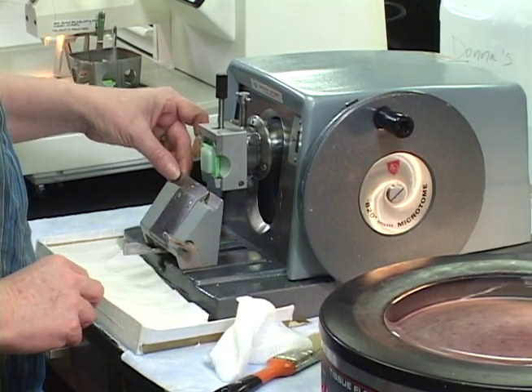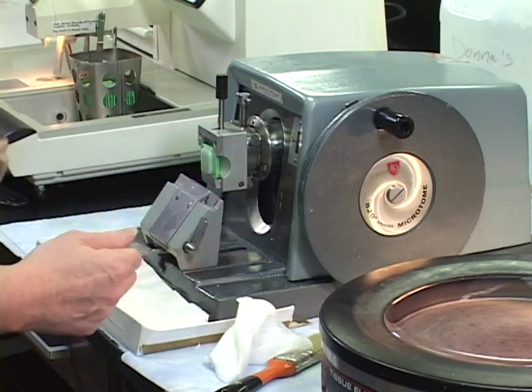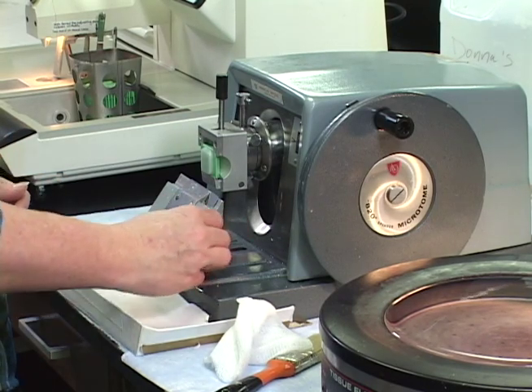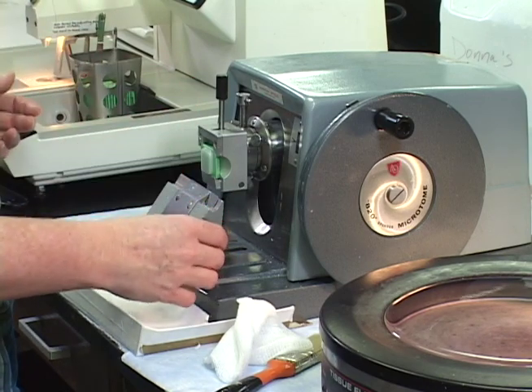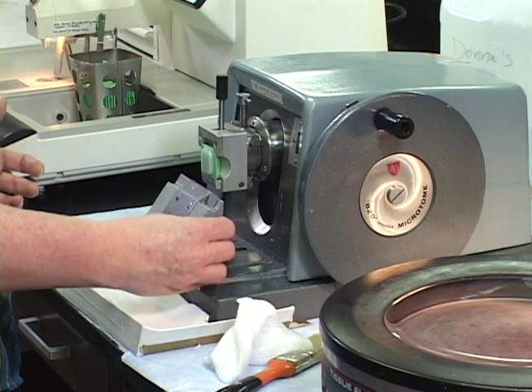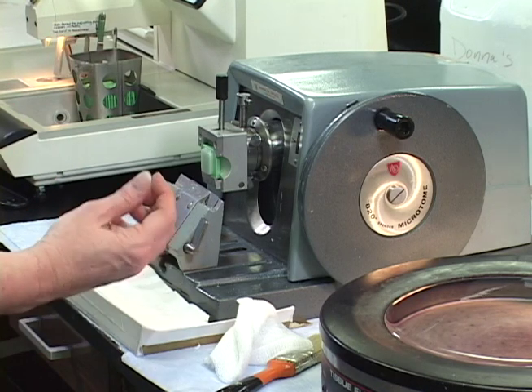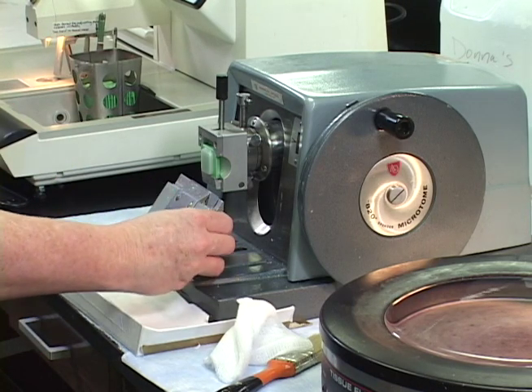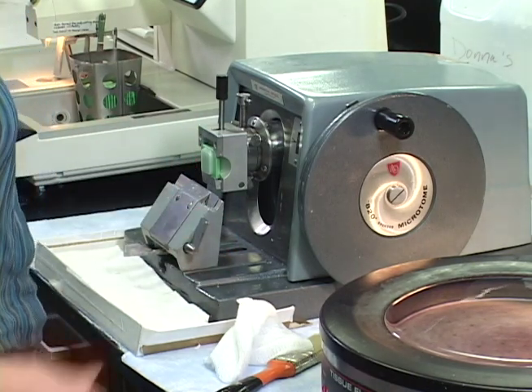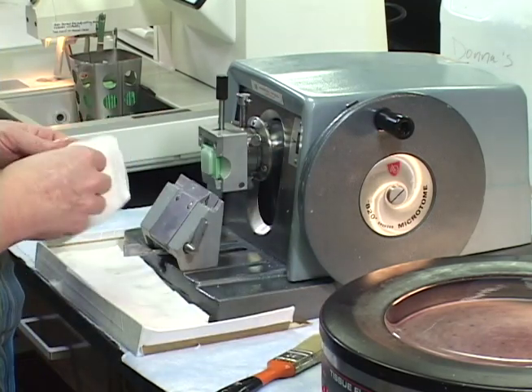Here's our knife clamp release. I put the knife blade in, and then I clamp it. Again, you don't need to crank it way over like this. And there are points in here where this is a good, nice clamp, and that's enough. It's got a little leeway for back and forth, but if you do it so tight, it actually torques the blade, and you're not going to get a good section. You get a feel for that. You can move it back a little, move it forth just a little bit, and again, it's got some clearance because it's an older machine, but it gives you an idea of what you need to do.